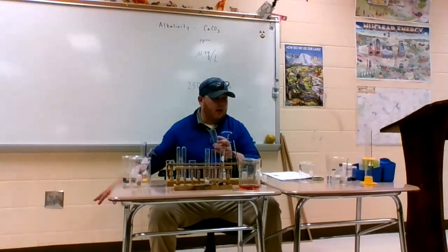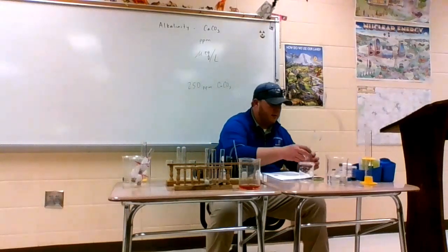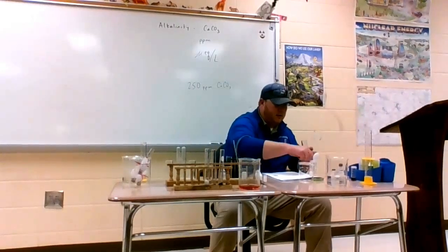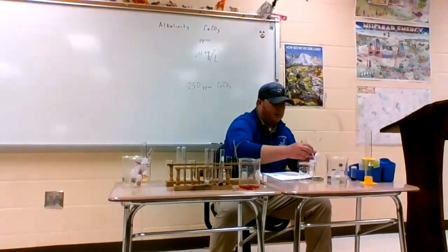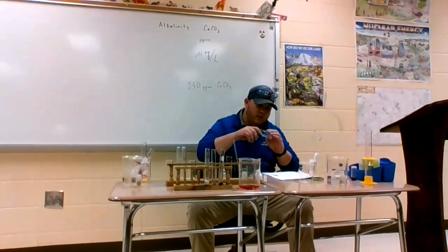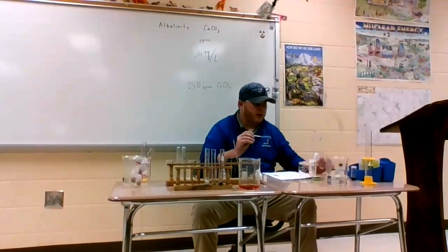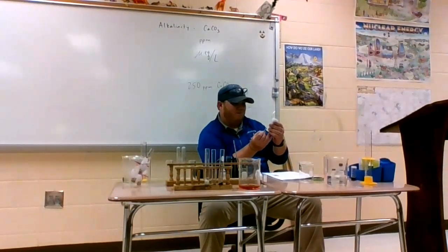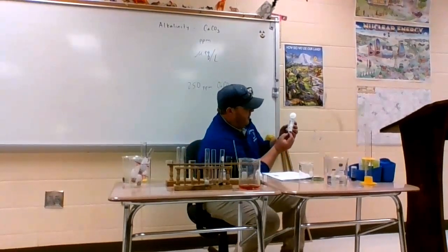I'll do the best I possibly can with this equipment. All right, so it's pretty yellowy. Between 3.5 and 4.